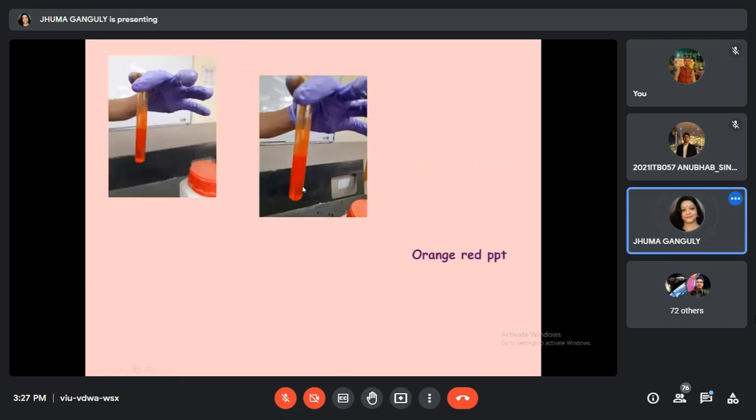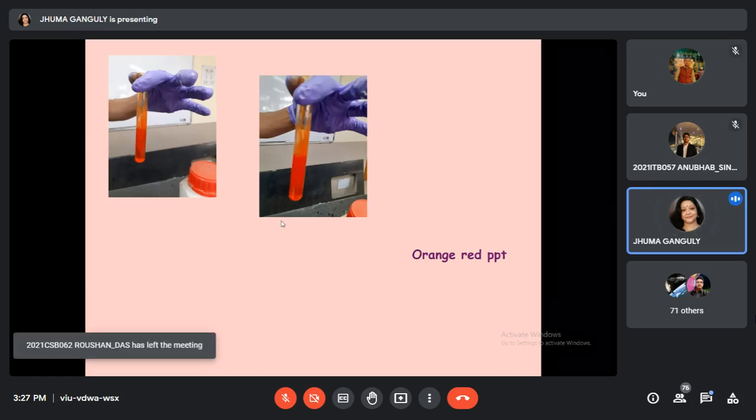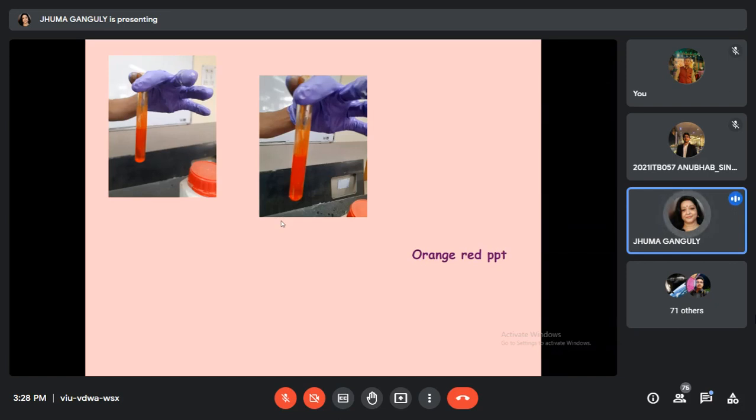And what happens in the laboratory is, if you put it on your hands, immediately it will stain, it's a dye. Its dye sticks to your skin and you will get some color. So it's like a fun thing, like mehendi. The girls prefer this like mehendi. They can start drawing actually.